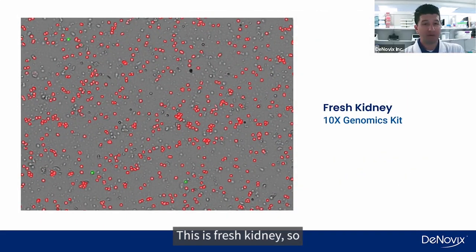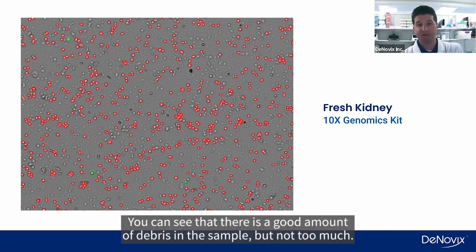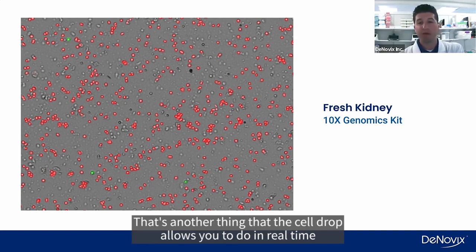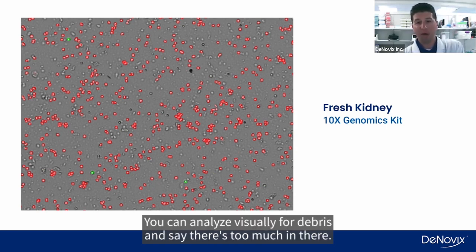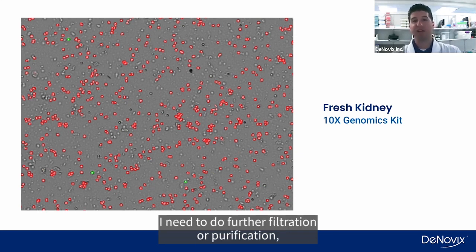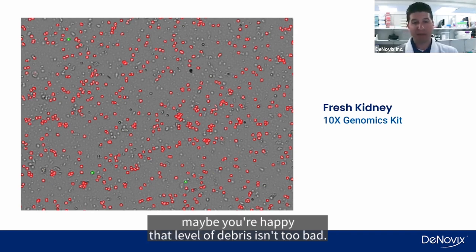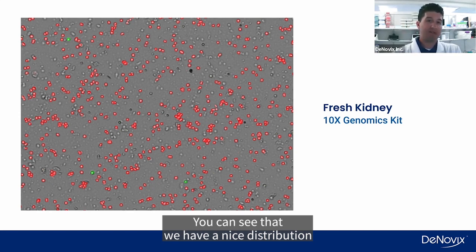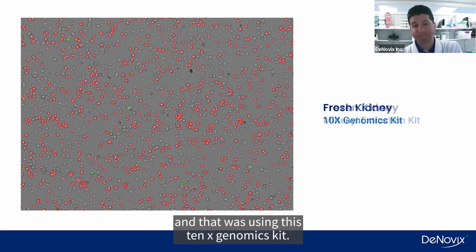This is fresh kidney, so not frozen, not FFPE preserved. You can see that there is a good amount of debris in the sample, but not too much. That's another thing that the Celldrop allows you to do in real time when you're looking at these images. You can analyze visually for debris and say, there's too much in there, I need to do further filtration or purification before I can move on with library prep. Or in this case, maybe you're happy that the level of debris isn't too bad. You can see that we have a nice distribution of single nuclei and very few intact cells. And that was using this 10x Genomics kit.